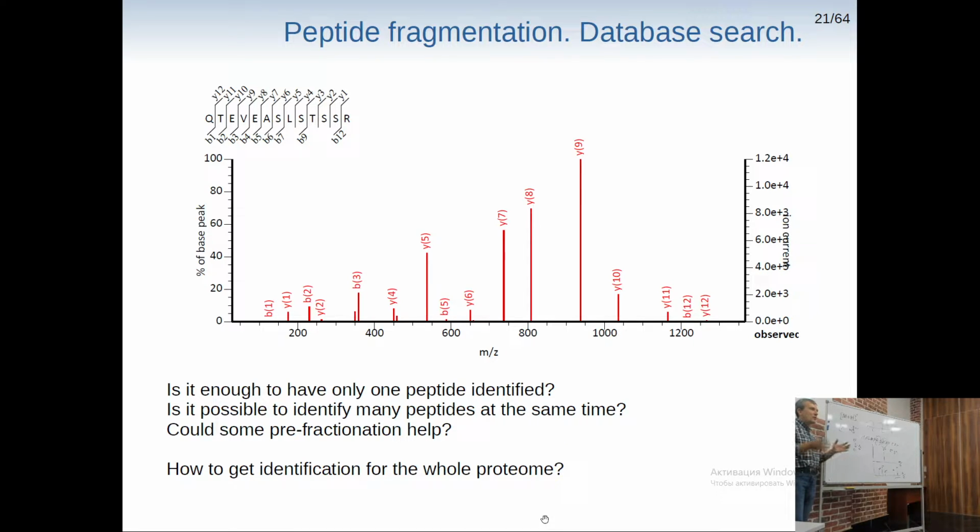But if we have the whole protein, we just trypsinize it. At the same time, probably not, but one after another in quick succession, why not? We can just isolate one peptide, then fragment it, another peptide, then fragment it, yet another, then fragment it, right? So the answer is a little bit troublesome here.